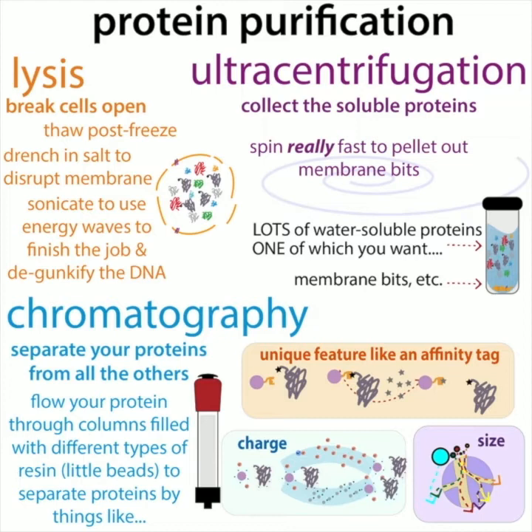I've never actually done that, but it is possible for some proteins, but you have to be sure that they're refolding properly. So ideally you'll have some sort of functional assay, some sort of readout of whether the protein's working. So say you're purifying a restriction enzyme, an enzyme that cuts DNA.